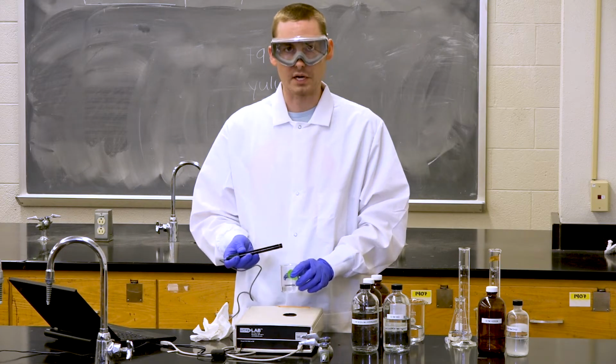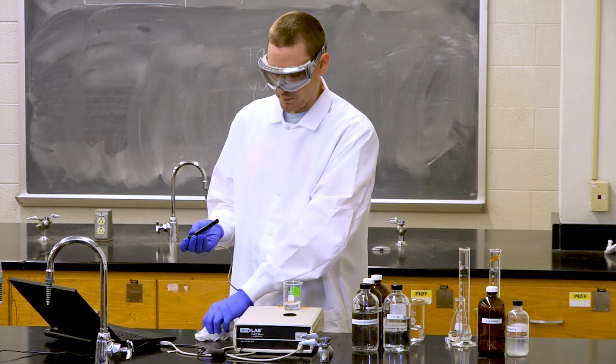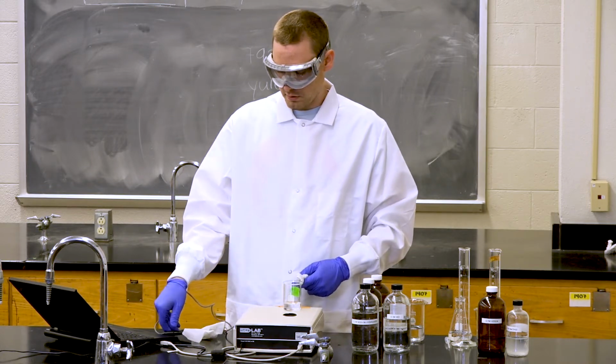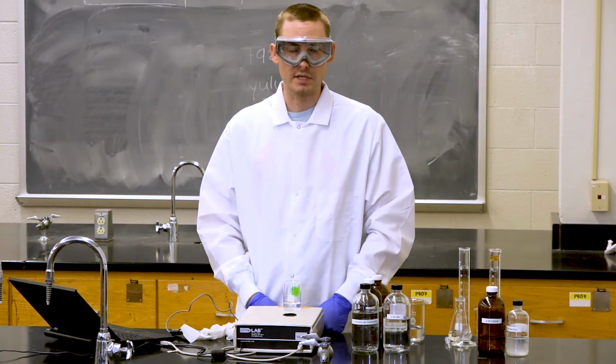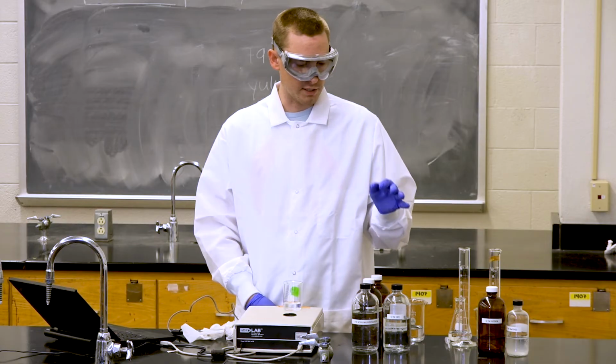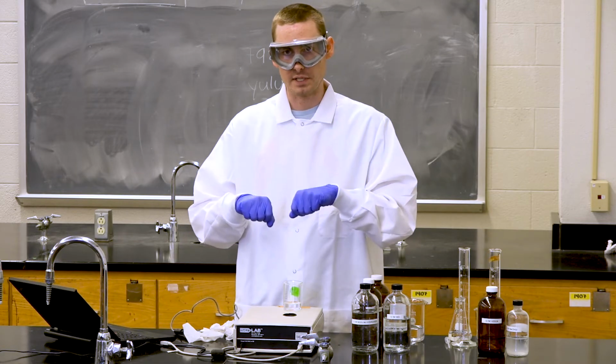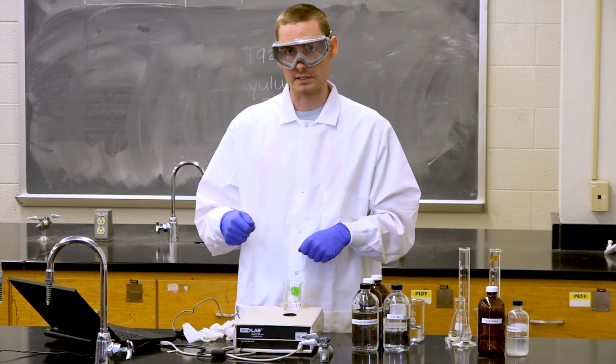Once you have finished measuring the conductivity, you can then wipe off or rinse off your conductivity meter. And then we will proceed to the next part of the experiment, where we will measure the conductivity of hydrochloric acid and sodium hydroxide, and then mix them together into solution, and then measure the conductivity of that solution.